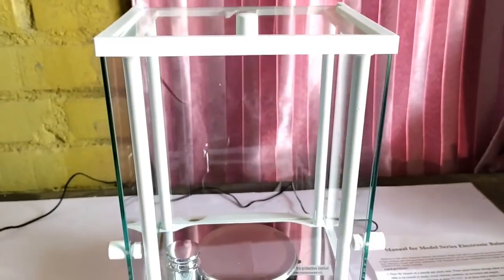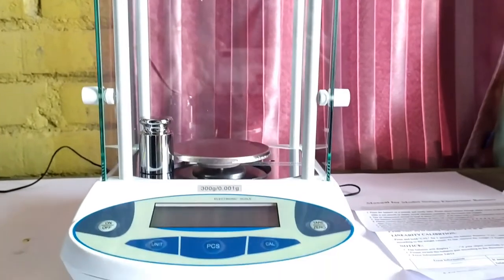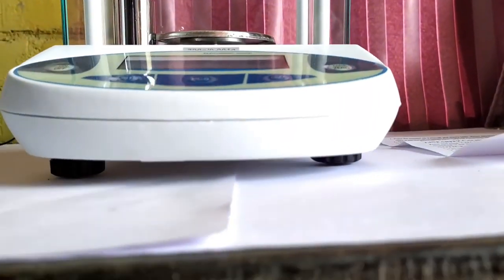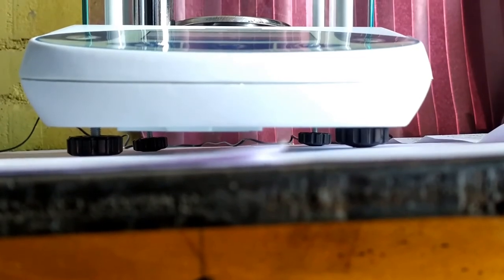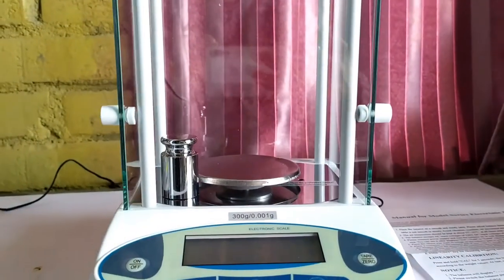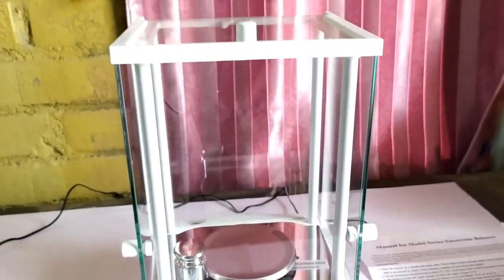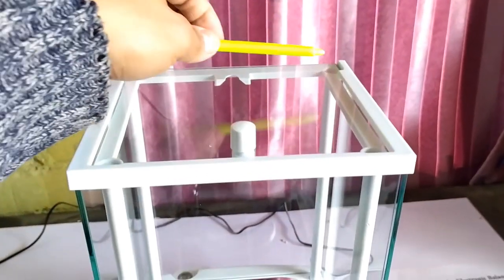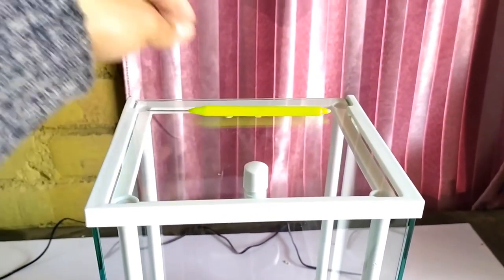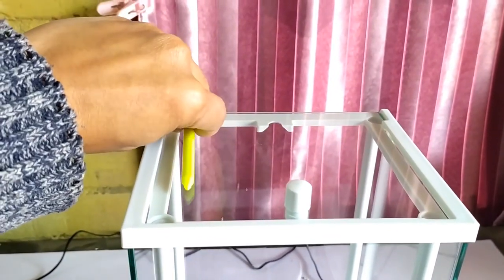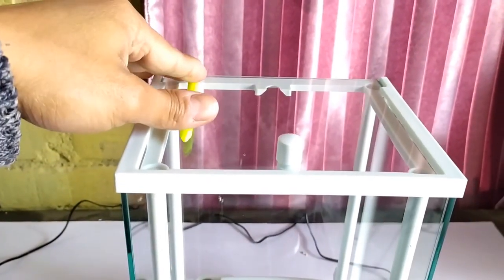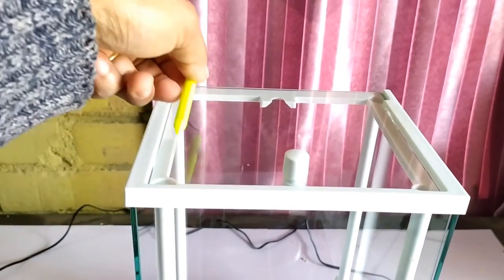I'm not sure if it's visible in the video, but the entire weighing scale is clearly and extremely inclined on one side so much so that even one of the leveling screws almost entirely got unscrewed from its place. To demonstrate how inclined the weighing scale is, I'm gonna put a free rolling object on top of the balance. As you can see, it rolls along the incline every time.